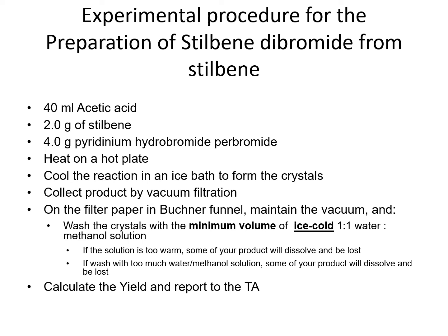Why is that? Because if our solvents are a little bit hot, they may dissolve the crystals, and we may lose our product. Also, whenever you use the washing, try to not pour too much solvent into the crystals so that they will not get dissolved.